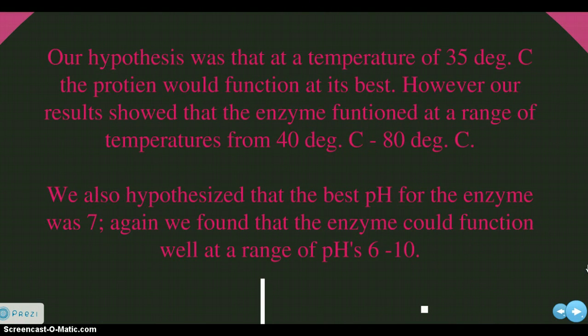So, were we right? Were we wrong? Our hypothesis said that at 35 degrees Celsius, the protein would function at its best. Our results showed that the enzyme functioned well from 40 degrees Celsius to 80 degrees Celsius. Those were its best reactions, its best, most brownish color.